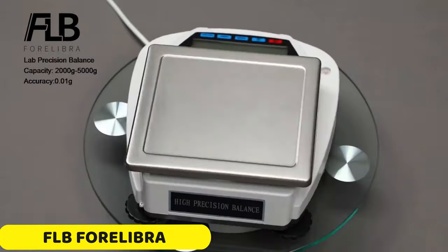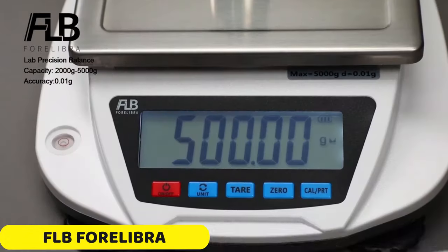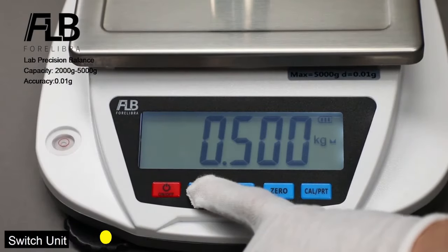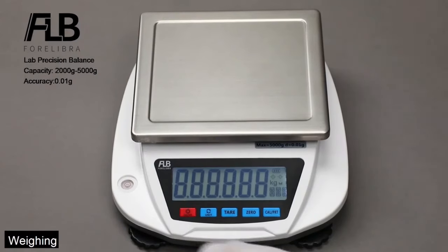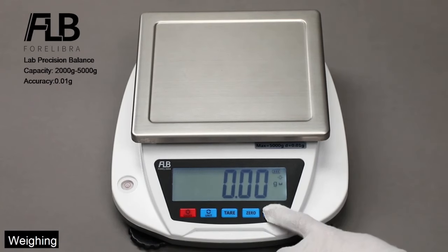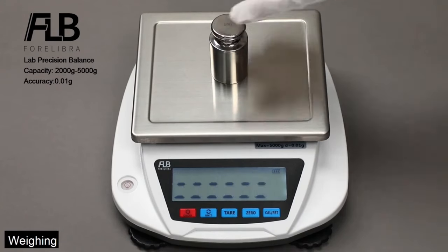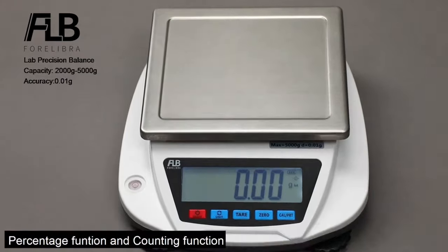Number 3: FLB Forelibra Analytical Balance. The FLB4 Libra Analytical Balance is a precise and accurate tool designed for laboratories, kitchens, and various applications. It belongs to the GM 0.01g series and is CE-certified, ensuring compliance with European safety standards. The balance is suitable for scientific experiments, research, and data analysis.